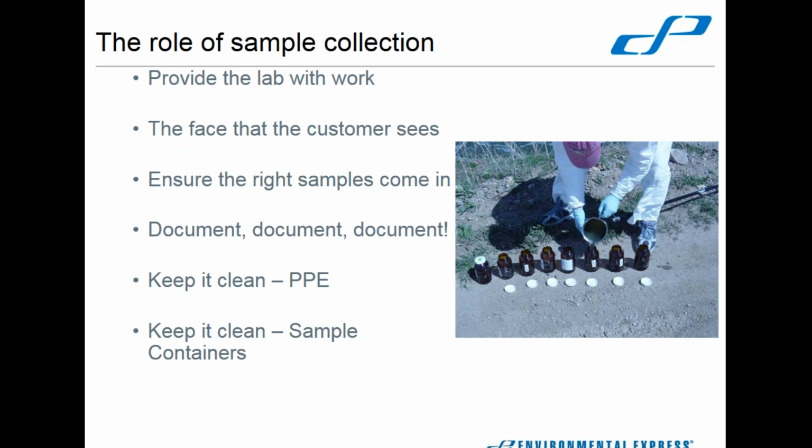Along those lines, you document. There are all sorts of things that need to be recorded by your field service personnel. Chains of custody, bottle labels, which I guess are part of the chain of custody, any kinds of receipts in and out, notes about problems you may have encountered, anything. Sometimes you've got those fun data loggers that actually track where you are and what site you have pulled samples from.